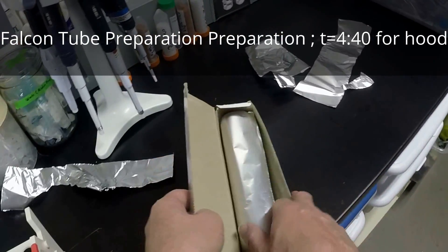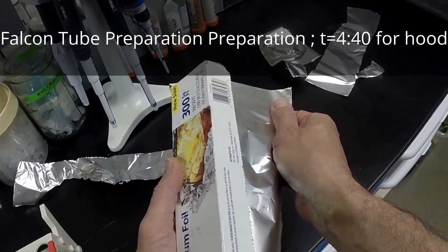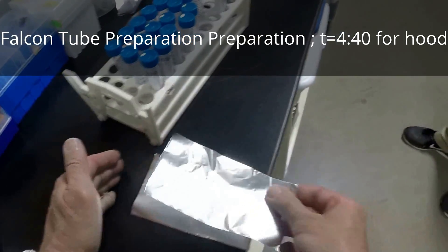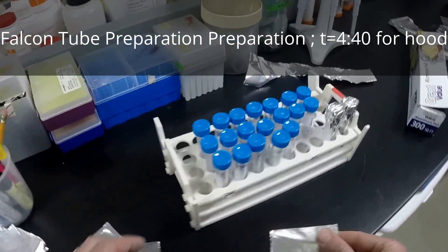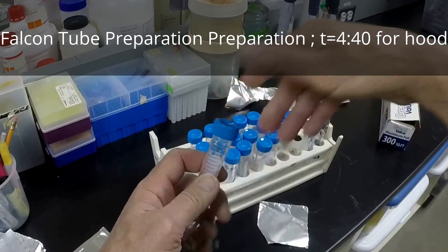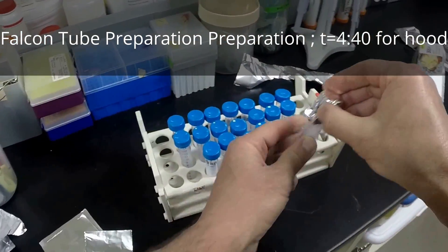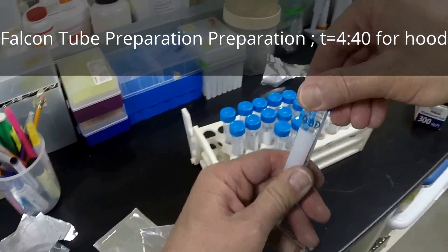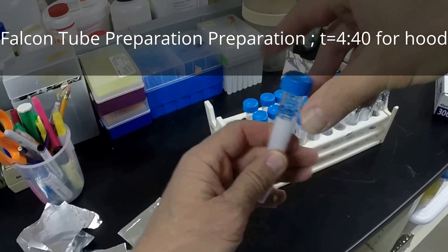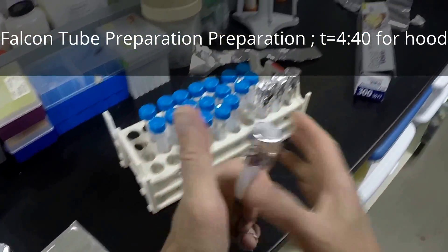These are not pre-sterilized — it's a mix of those that have been washed and so forth. So we're going ahead getting these tops made. Pull it to the point where it's just catching about half a thread and put it on top. What that does is prevent it from collapsing in the autoclave. Just enough to hang it on there, and that'll give us enough to run it in the autoclave.